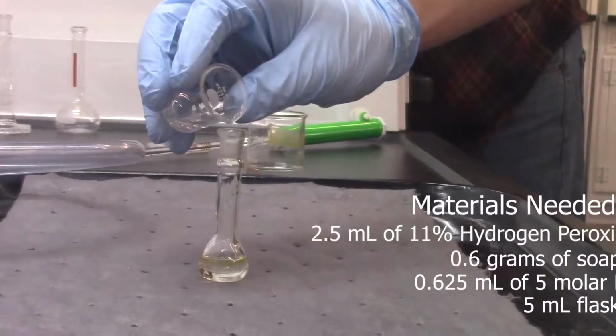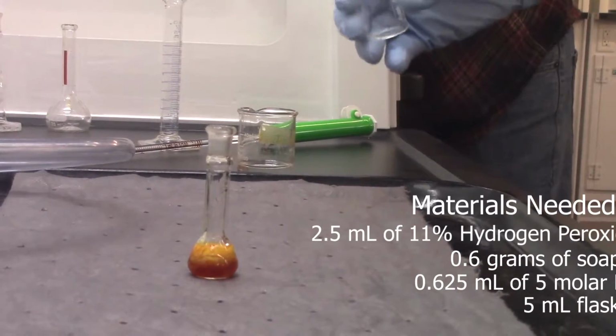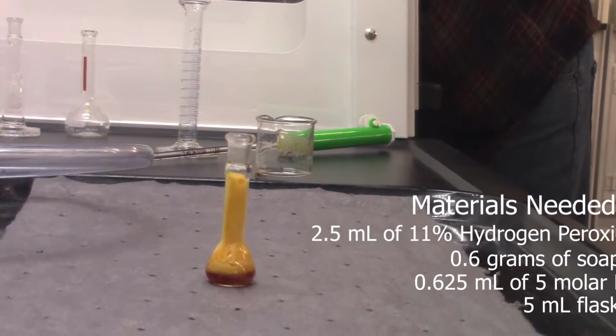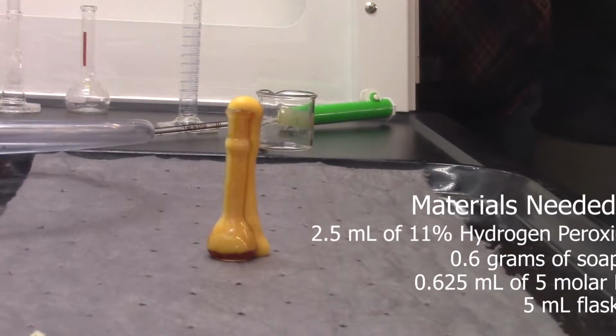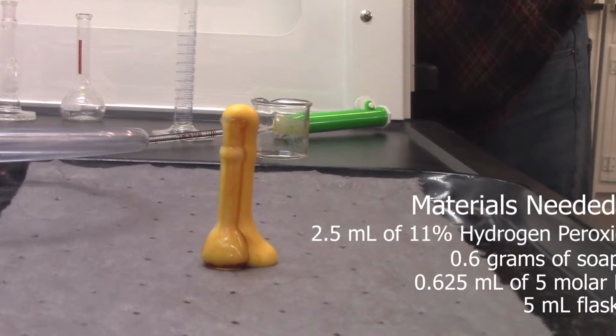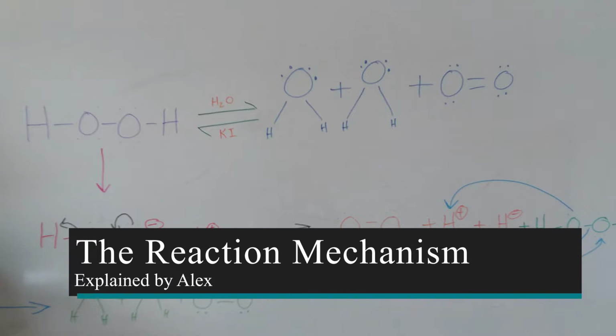And this is the culmination of all our hard work. Well, it changed colors. I'm really happy with this. Wow, that's awesome. This is the mechanism for Elephant Toothpaste.